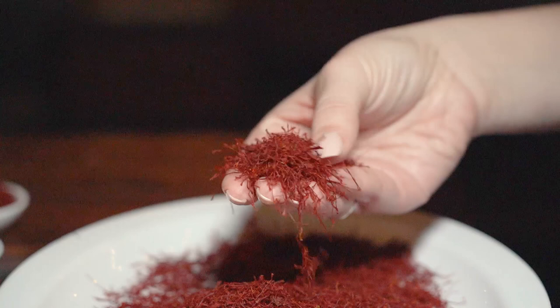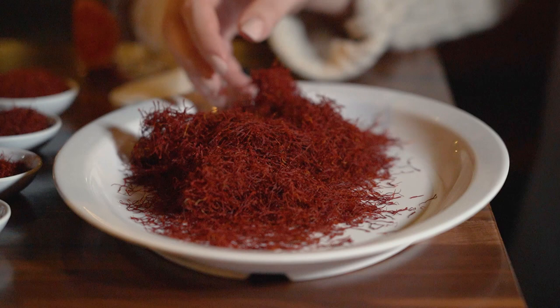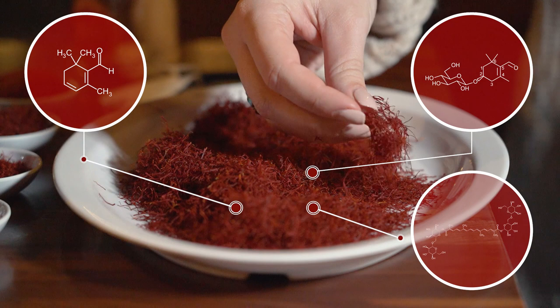The next series of tests verify the chemical potency of the saffron. The chemicals crocin, picrocrocin, and safranal are responsible for the color, taste, and aroma of saffron. The presence and potency of these chemicals are measured by a numerical score. According to the ISO, high quality saffron should have a crocin score of 200 and above, a picrocrocin score of 70 and above, and a safranal score within a min-max range of 20 to 50.